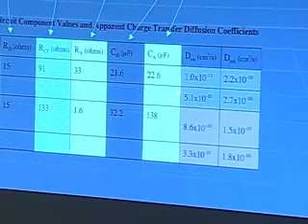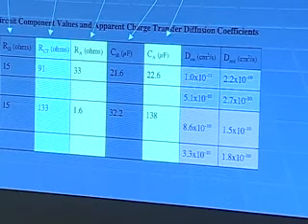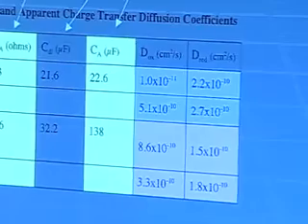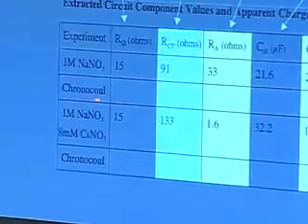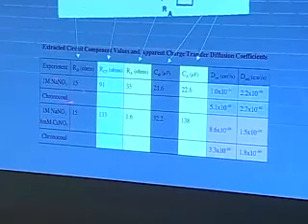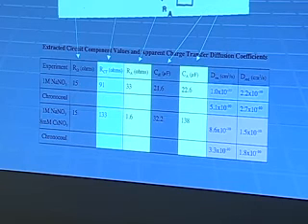This is for the oxidation, so we are expelling cations from the surface as we do that. I would have guessed if we were going to be off on one, it would have been one of these down here, because this is the pure case where we have a more ideal electrode. But getting within a couple orders of magnitude on a diffusion coefficient is typically good enough. It would be nice if there were really good ways of measuring diffusion coefficients that got you the right answer within a factor of 2 or whatever, but we don't really have those.